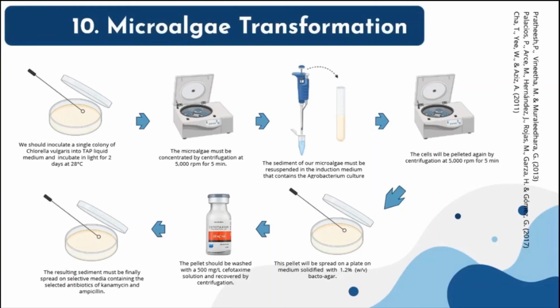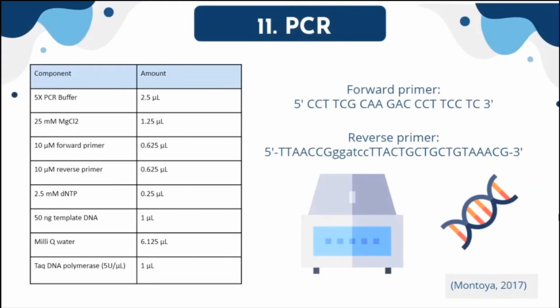These plates will be incubated in the dark for 2 days. After this time, they will be exposed to the light for the selection of the colonies. Another PCR will be performed to confirm the genome integration of the transferred genes into our Chlorella.